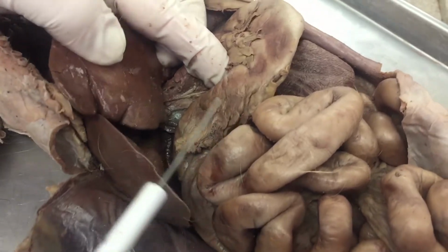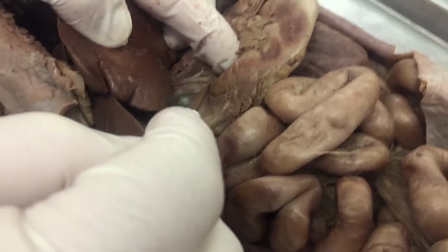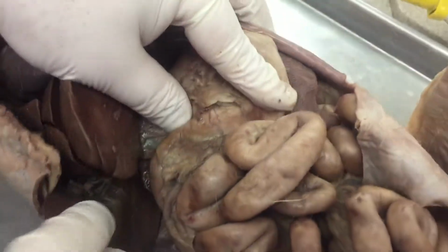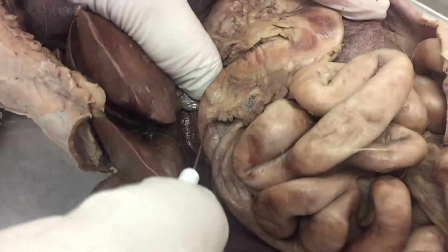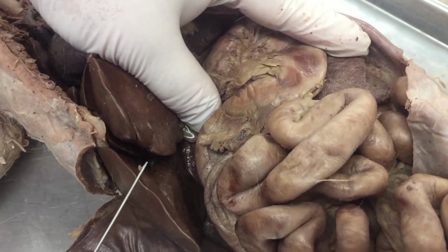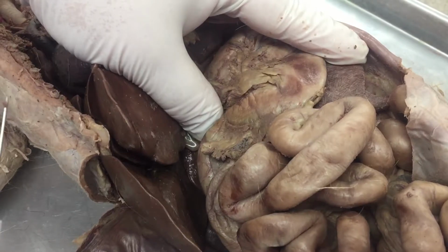Right here on this one, especially on this cat, you can see that it's kind of pinched right here. That is the pyloric sphincter, where it leaves the stomach and goes into the small intestine. This first portion of the small intestine, just this bend here, which is probably an inch long, that is called the duodenum. The duodenum will have, for our purposes, like 5 things squirt into it.